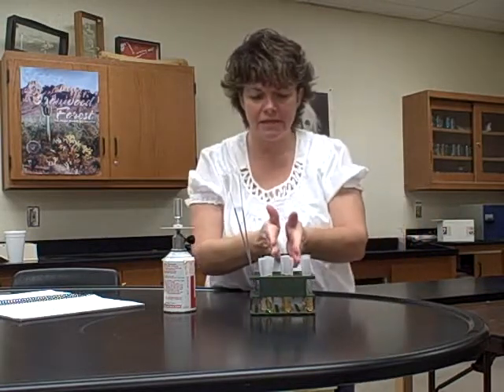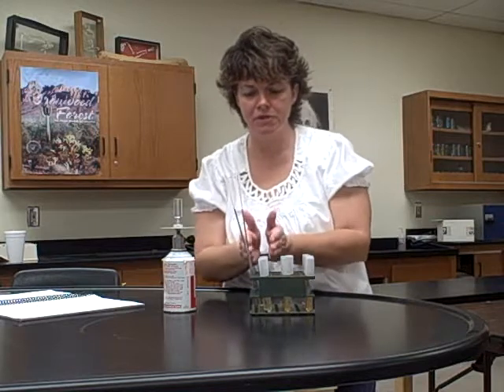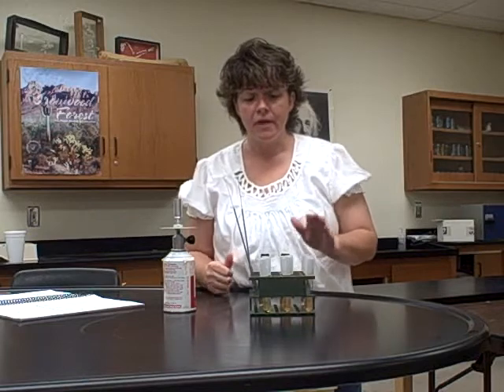So then you do that exact same procedure with the other 2 bacteria. And like I said, you have one person assigned to this bacteria, another person assigned to this one, and another person assigned to this one. And I want you to put both tubes in one hand. It's going to seem a little bit awkward at first, but it's the way that I'd like for you to learn to do it. Then you're going to take all your tubes when you're done with everything, and you're going to put them in the incubator.